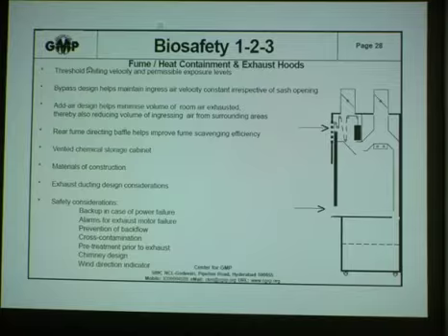Next comes a question of the exhaust ducting. As you exhaust the air to the outside, the air should be accelerated. To be able to accelerate air, the duct size progressively reduces. Since the quantity of air that is moving is equal to the cross-sectional area times the velocity of the exhaust stream, as the area decreases, since quantity is the same, the velocity increases.